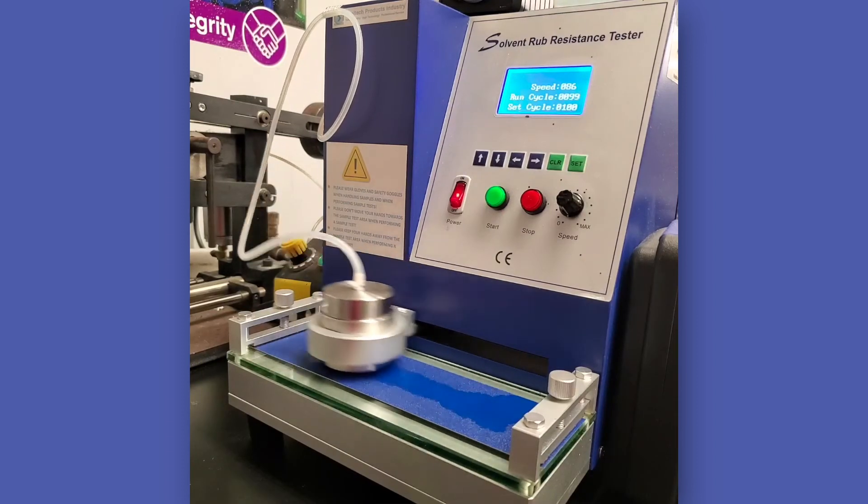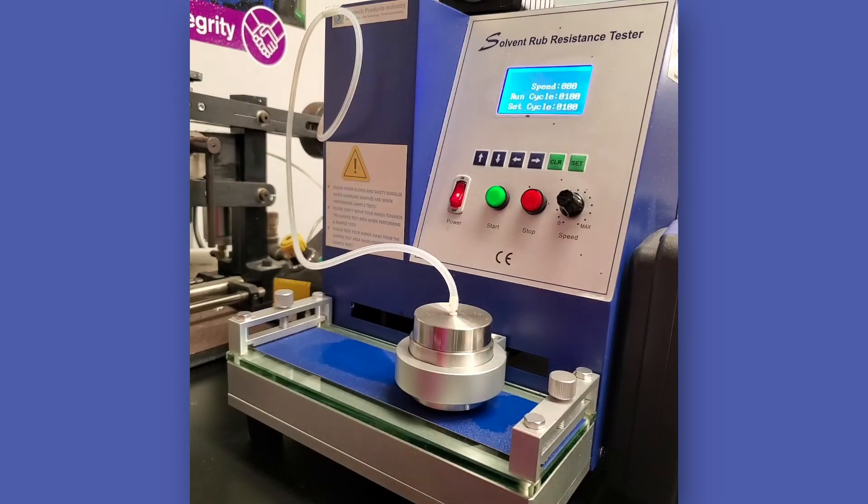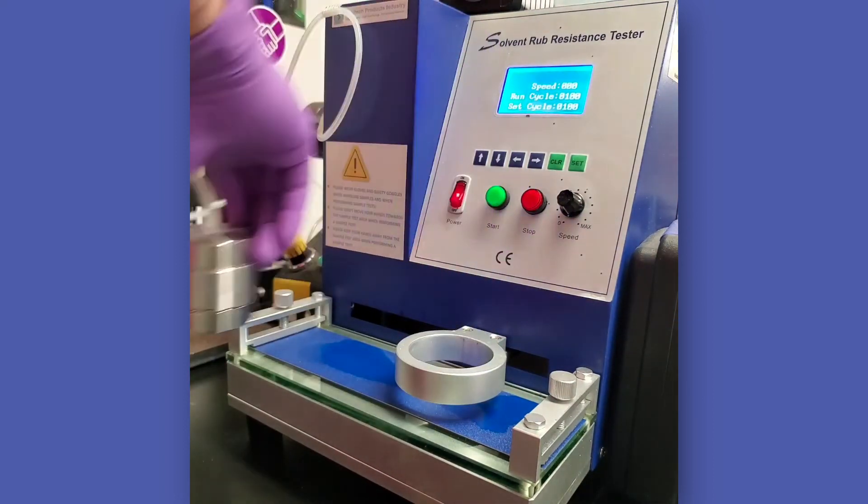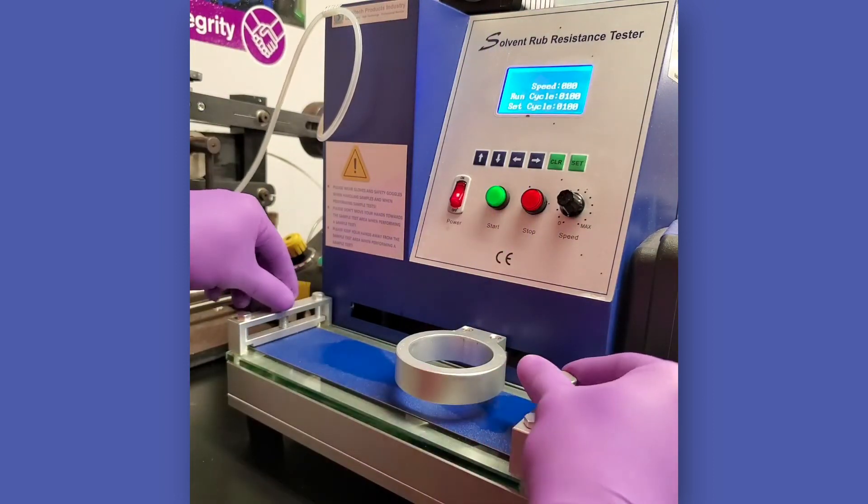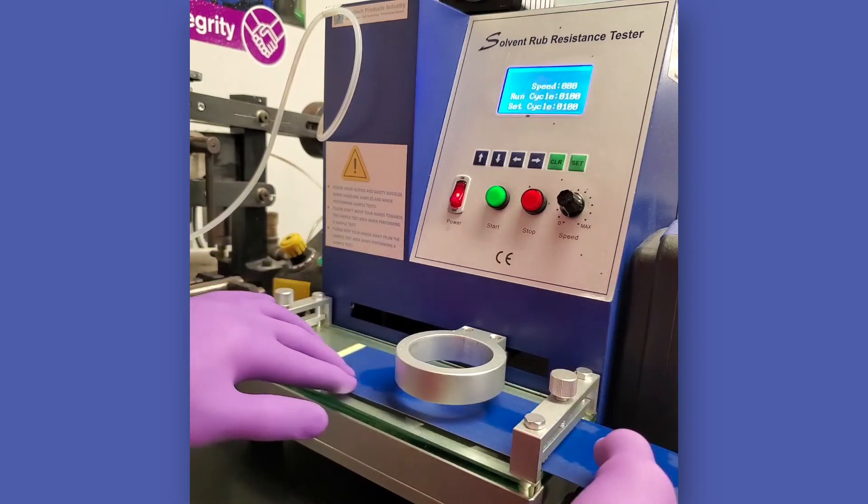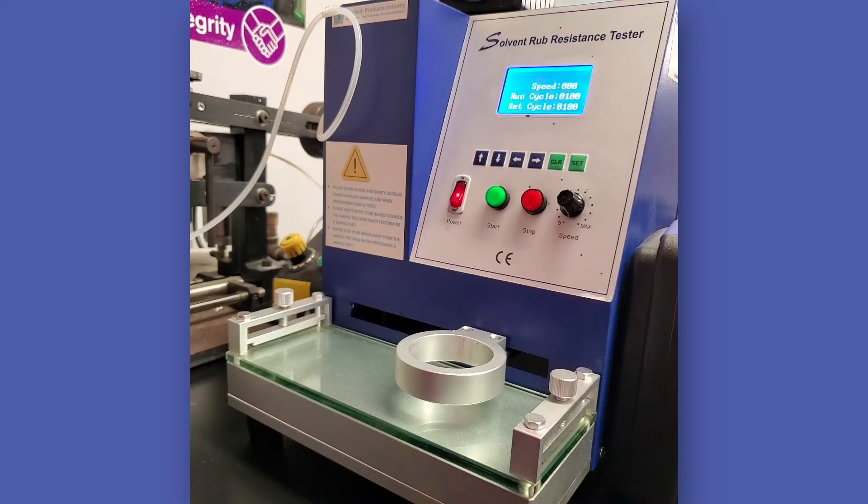The test may be run in two different ways. In the first method, the machine is allowed to run for the set number of counts as agreed upon between producer and user, and afterwards the coating is inspected for the appearance of the substrate or coating breakthrough. In this method, the result is pass or fail.